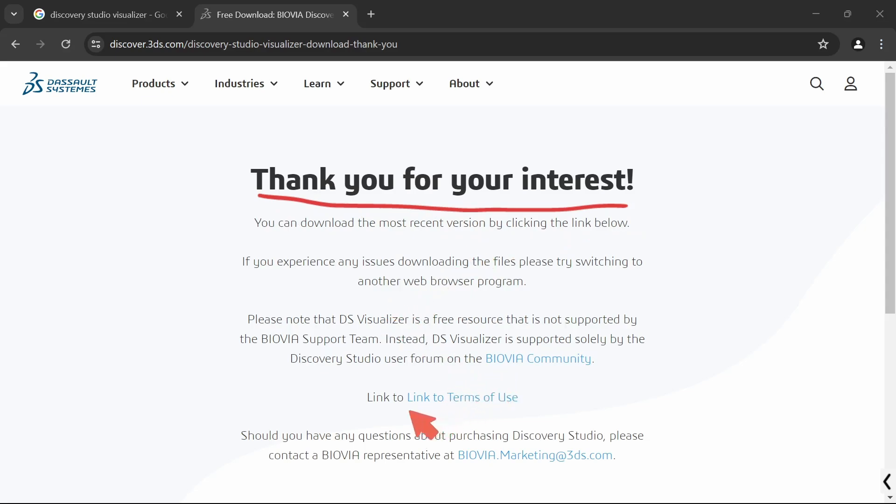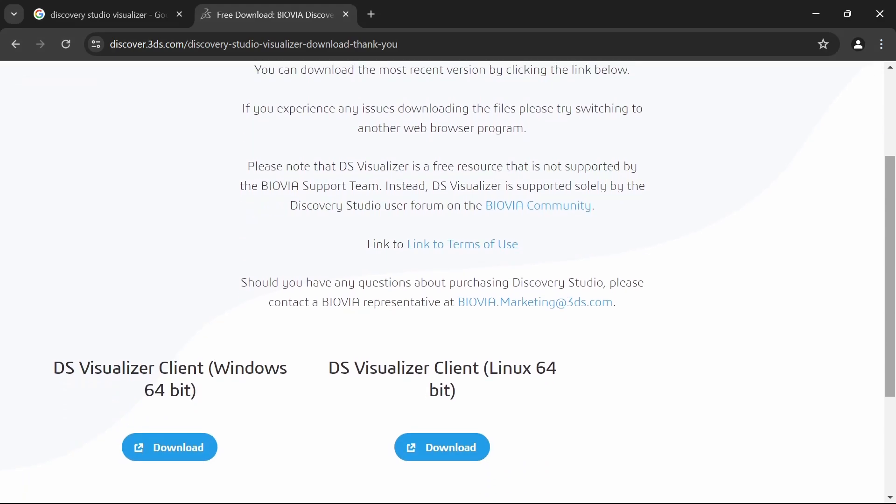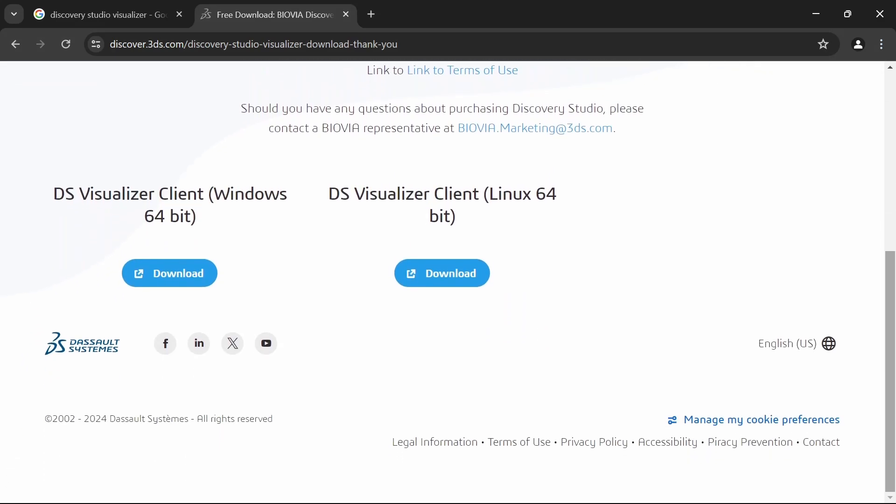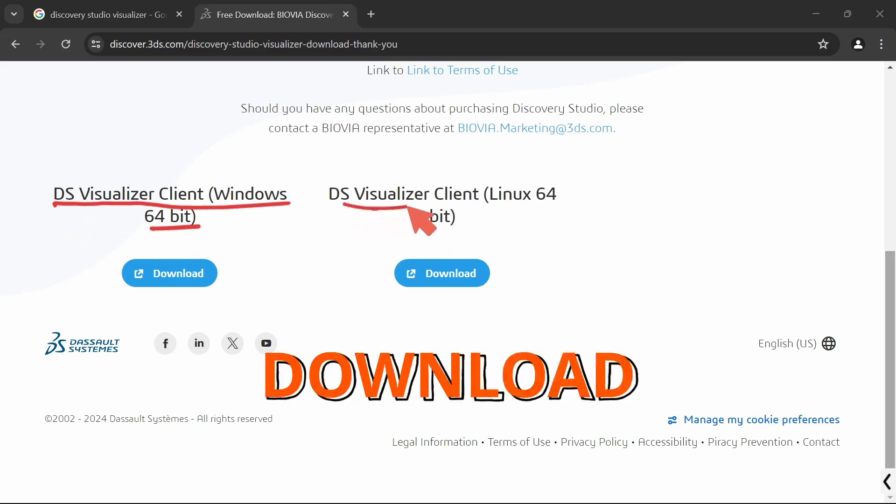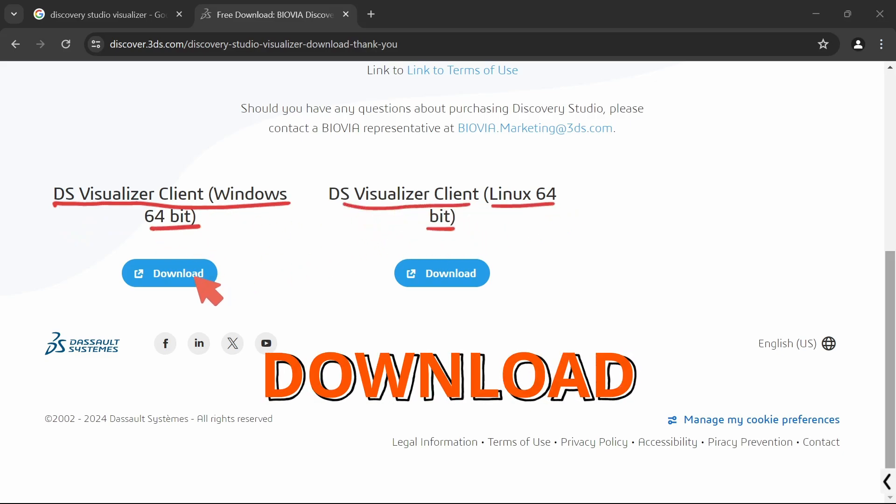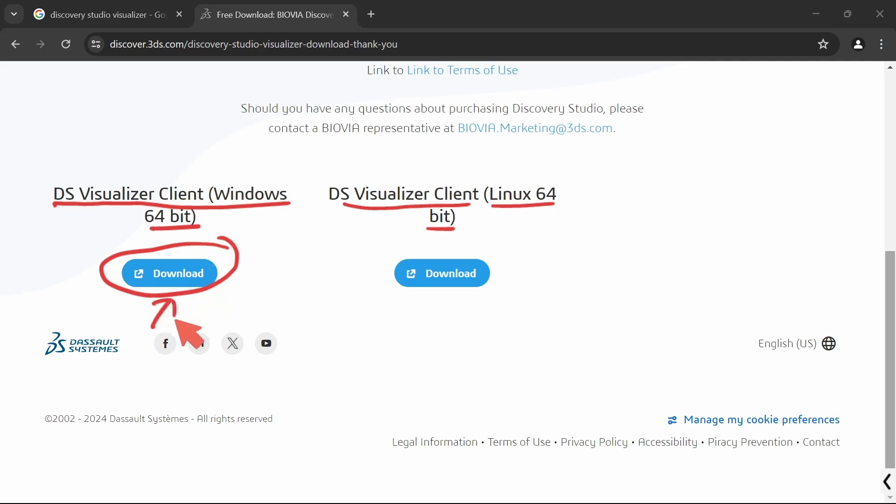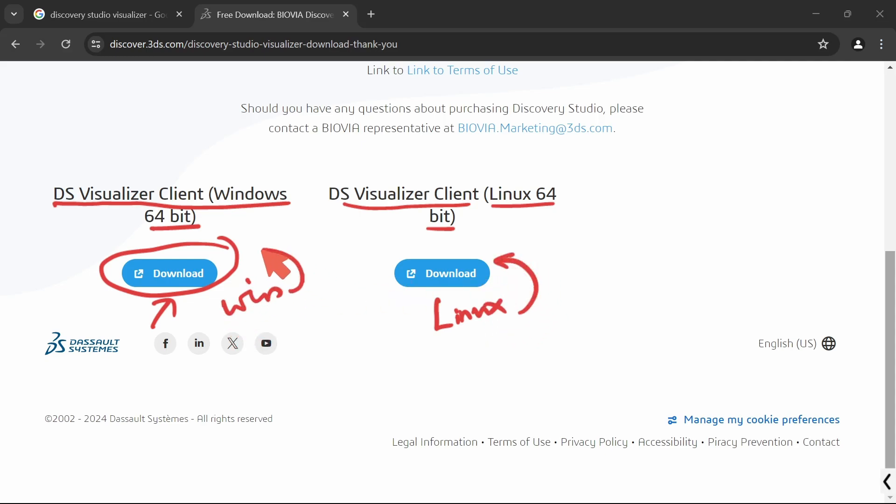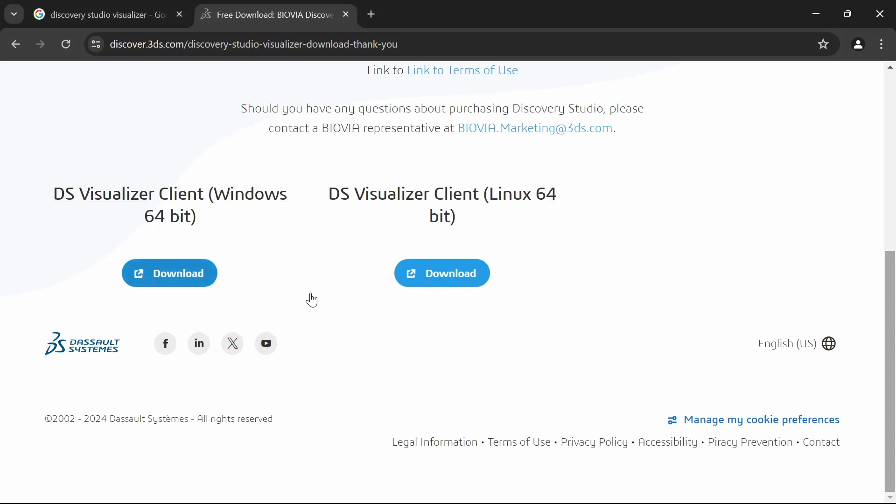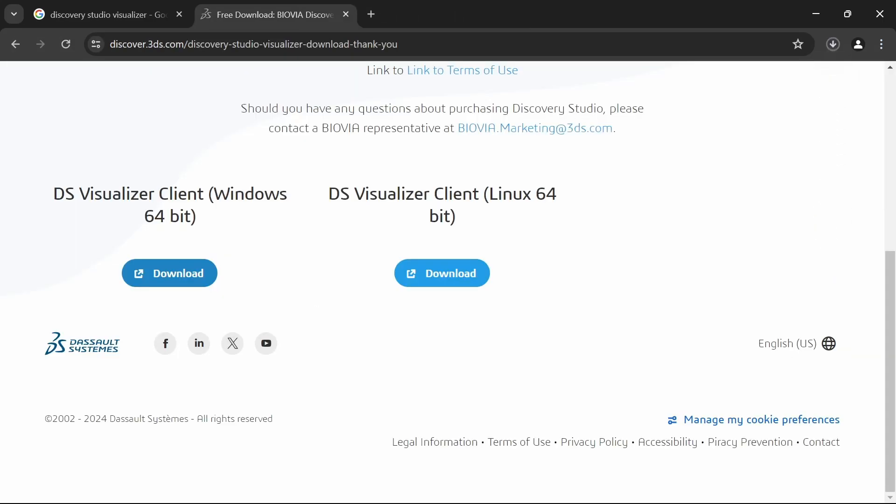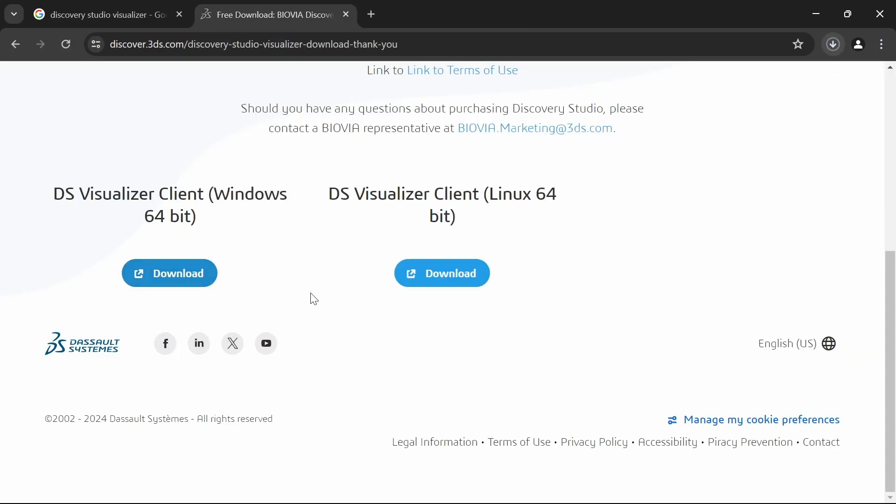Now you will be taken to this webpage. Scroll down in this webpage so that you will be provided with two versions of the DS Visualizer client. One is for Windows, another one is for Linux. Both are available for 64-bit versions only. Click on the Download button for the respective versions. This one is for Linux and this is for Windows. Just click on the Download button. The download will start automatically.